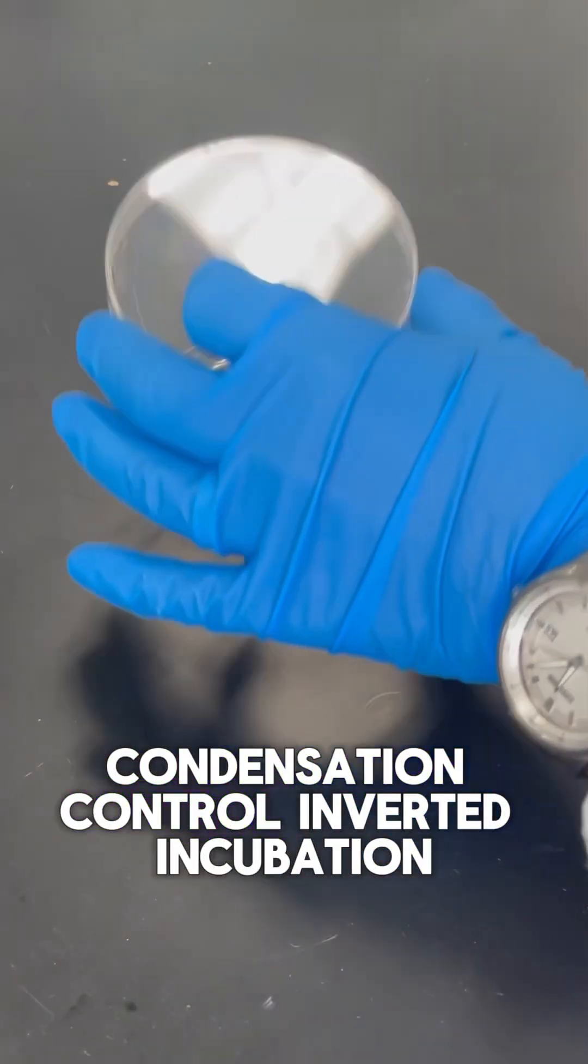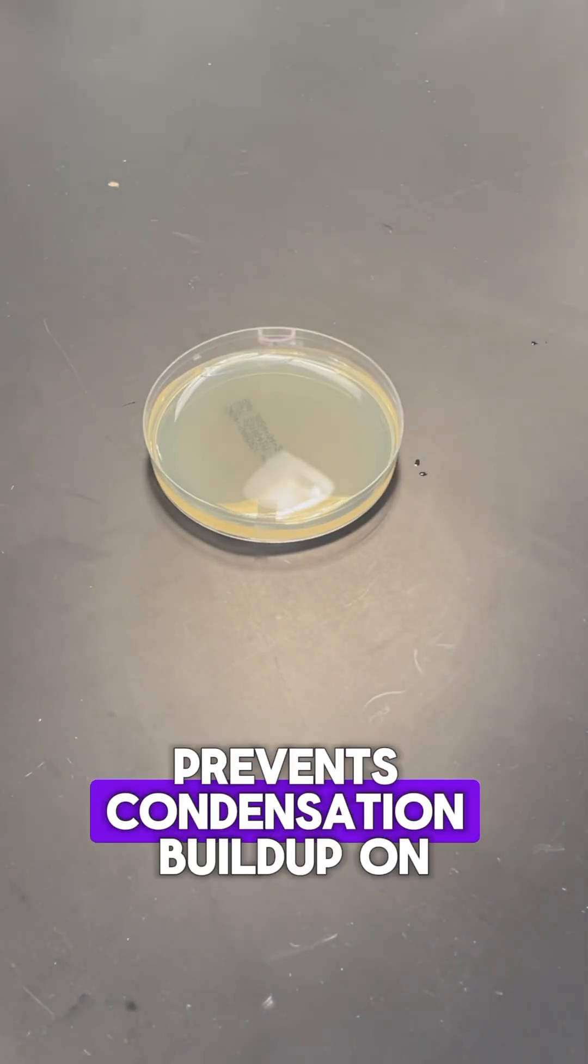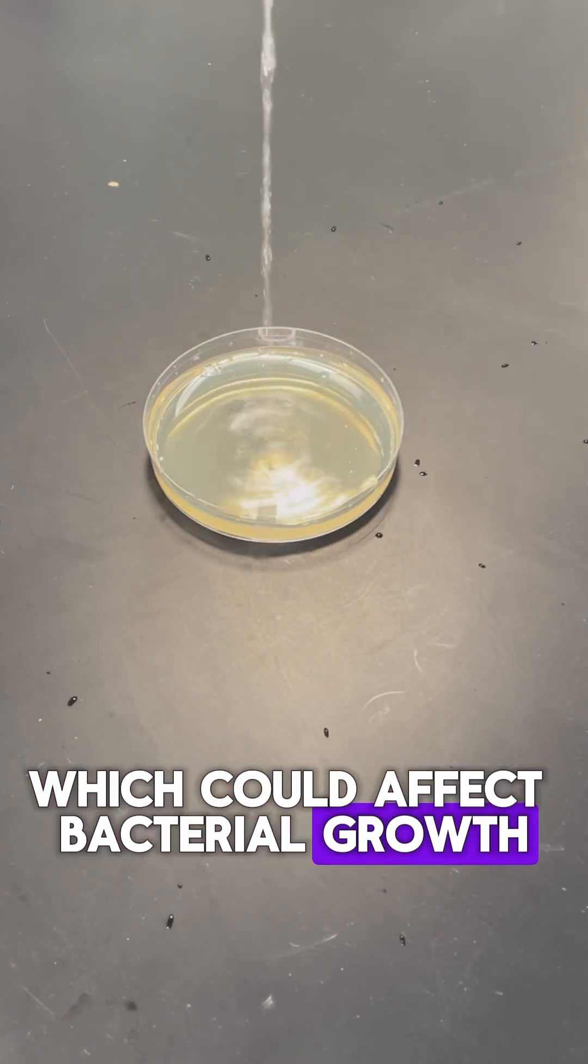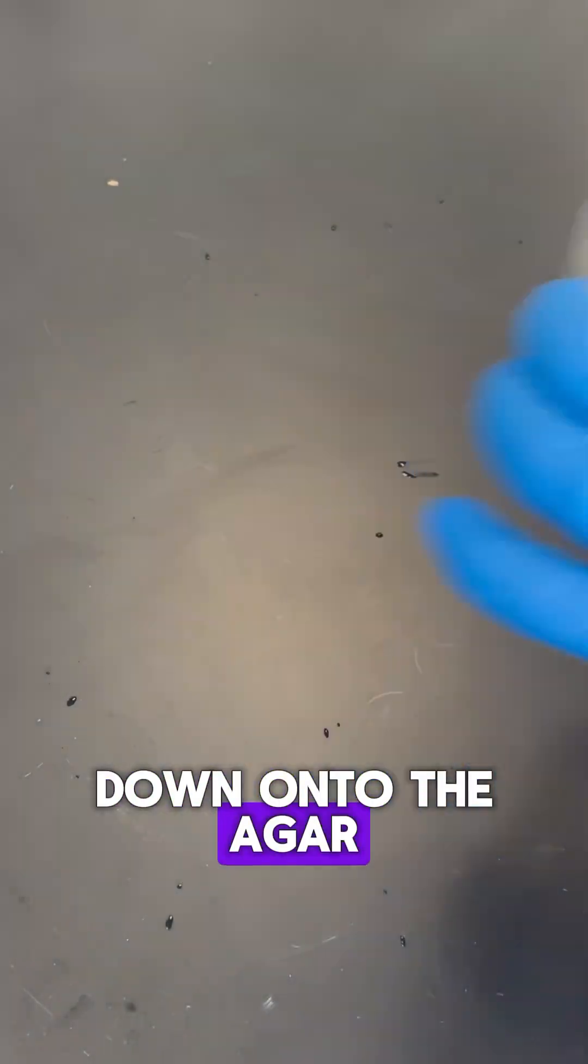1. Condensation control. Inverted incubation prevents condensation buildup on the lid, which could affect bacterial growth if the water drips down onto the agar.